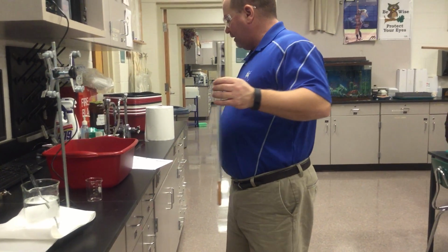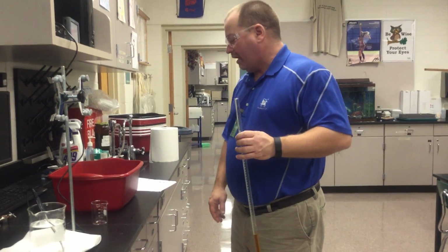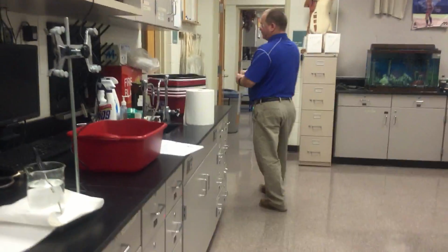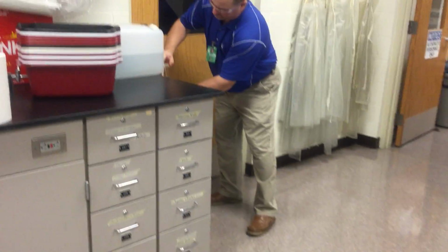It says while holding the eudiometer slightly tipped, very slowly pour distilled water from your 100 mL beaker, being careful to layer the water on the acid. So I'm just going to get my 100 mL beaker.